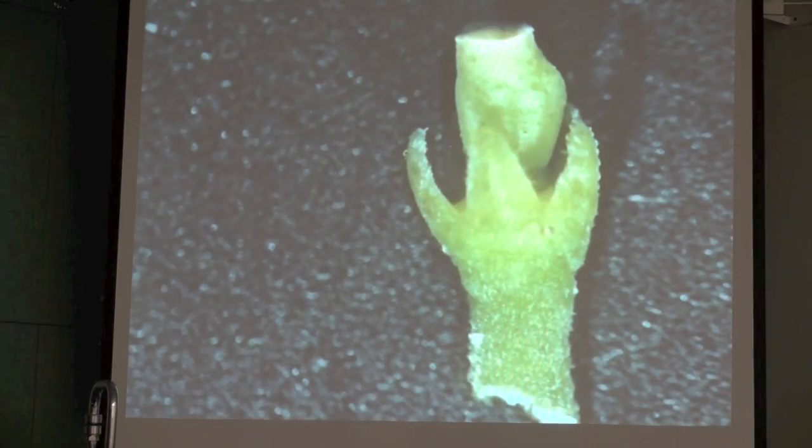Alright, looking at one side. Right, so now we need to turn this one around. This is the mature flower.